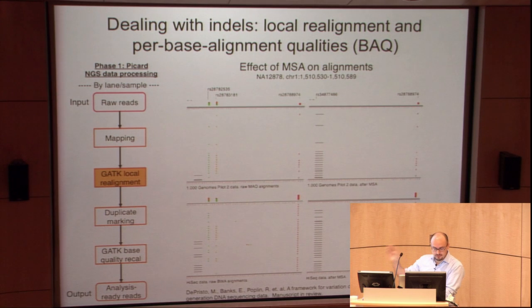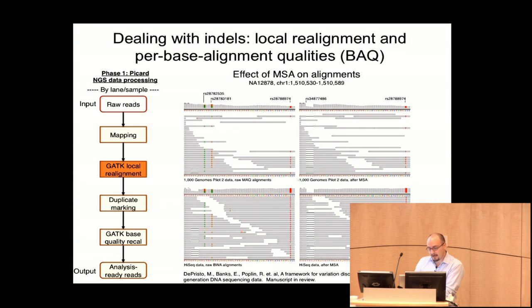All right. I will skip over this. Suffice it to say that it's very important to deal with indels. There are a variety of things that it's very easy to mistake because these reads are very short. Indels for SNPs. There are many tools to deal with this.